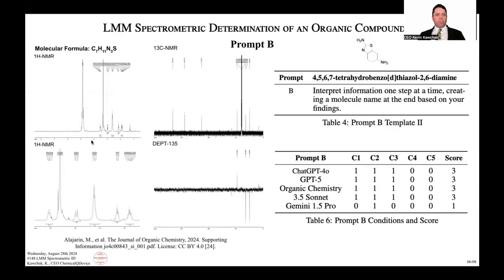And there were just other impurities too. Like I said, these 2 tall peaks weren't labeled. One of those likely corresponds to the 4 hydrogens off the nitrogen. And there's this other sharp peak further upfield, and then there are other impurities too. So I wasn't quite sure. I couldn't really pinpoint it, but that definitely did not help these models.